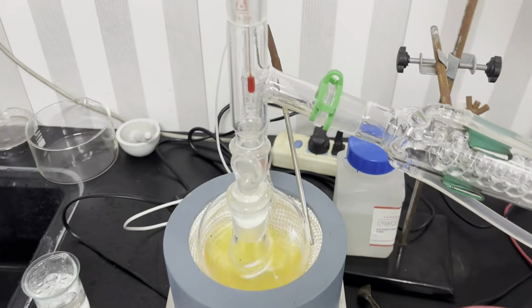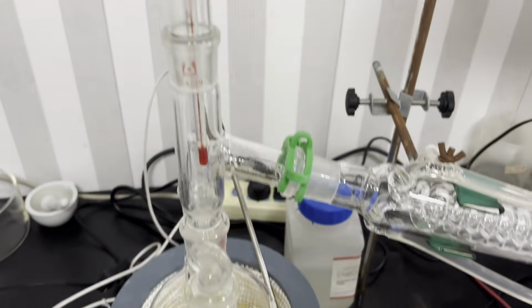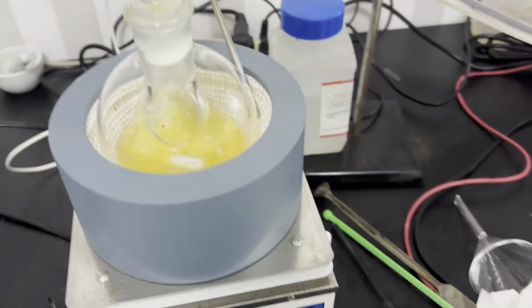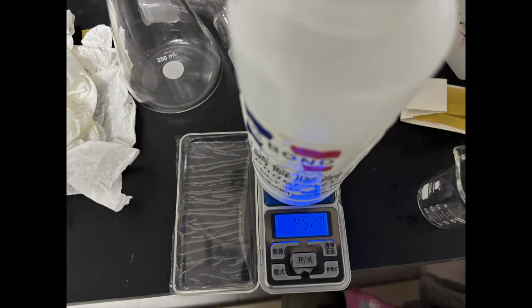When the entire bottle of 500 ml of diacetone alcohol is added through the funnel and the temperature rises above 60 degrees C, the distillation is stopped. The content in the flask is yellow due to byproducts, probably condensation products between acetone and diacetone alcohol. Off camera, I distilled all the crude acetone to purify it and remove water.